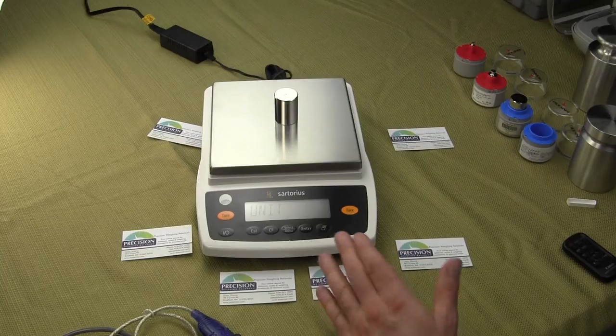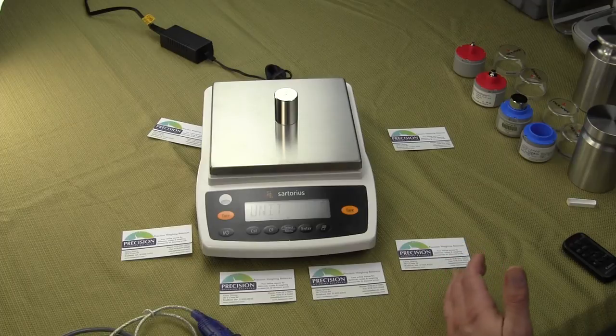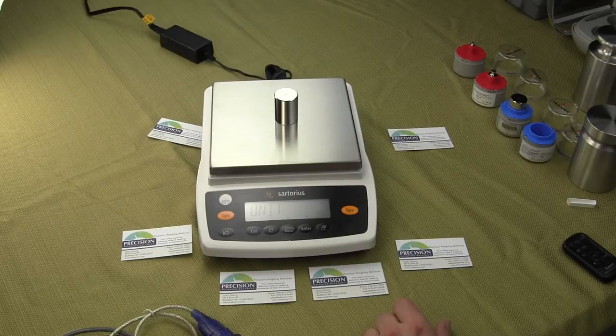Whether that is Grams, Penny Weight, Troy Ounces, Grains, Tael — there are about 13 units or so that this balance can weigh in. Basically any weigh unit you can think of, it does.